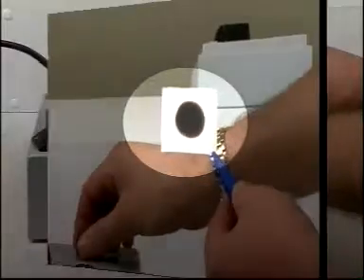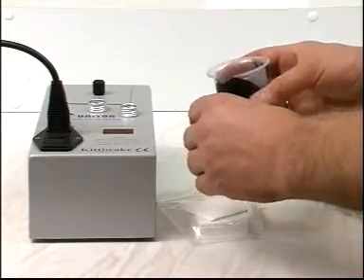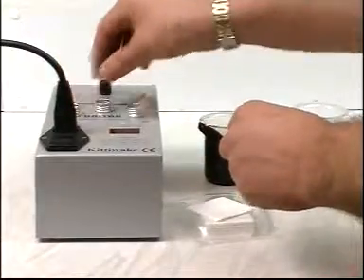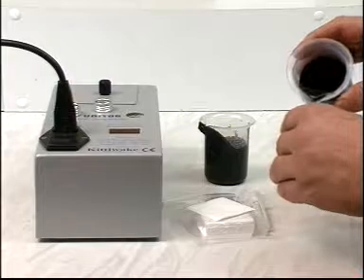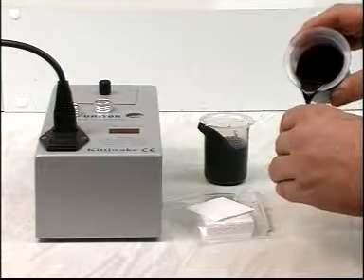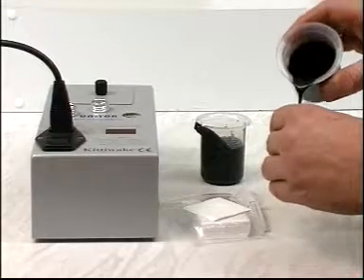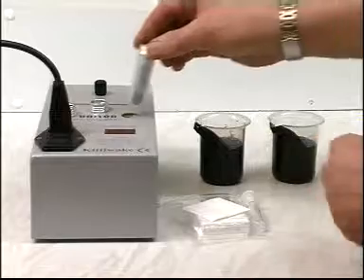To find if two fuel oils are compatible, first repeat the sample preparation procedure used in the stability test. Take two fuel samples and place them in the preheat holes of the fully heated unit. Press reset and leave for five minutes.